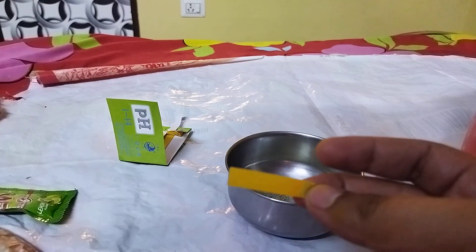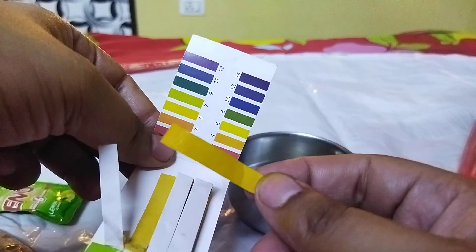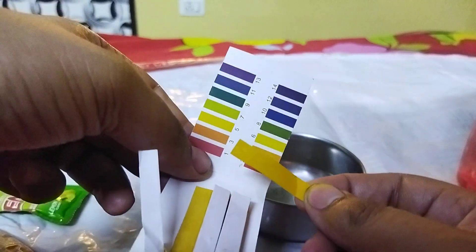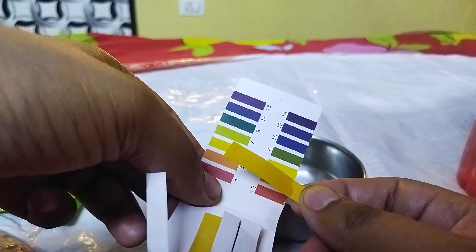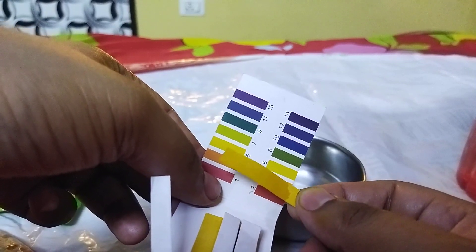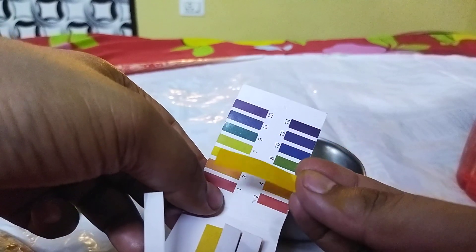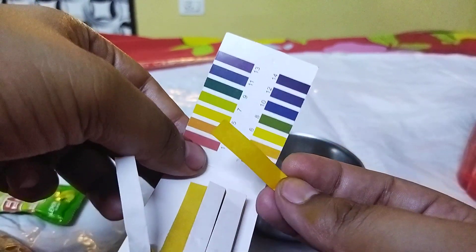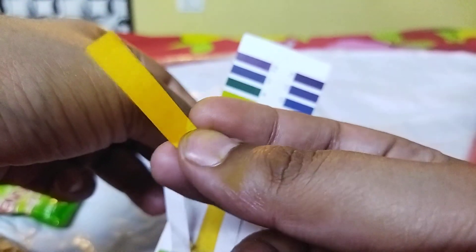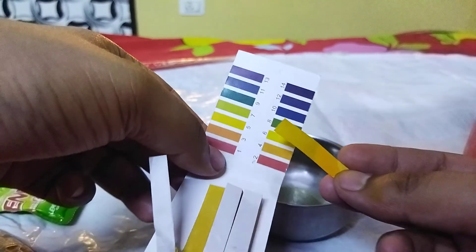Now we see it hasn't changed that much, so let's look at the indicator chart. It's still a little wet, but as it dries it is turning somewhat orange in color — just a little bit. I hope you can see it too — it is slightly orange in color.